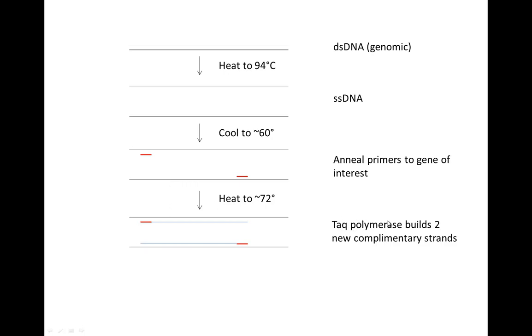Having a polymerase that can withstand 94 degrees without denaturing allows you just to repeat this process on end without having to stop. So you just keep repeating that 34 times, and you come out the end with billions of copies. And I would say that this reaction is going to take about an hour and a half to complete. Now that's going to be done outside of lab.